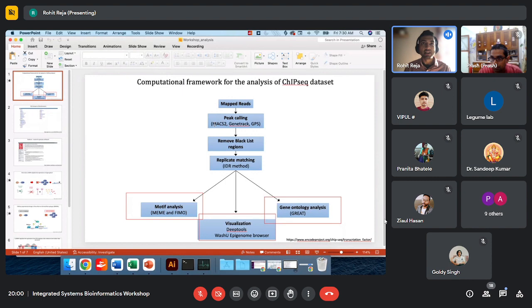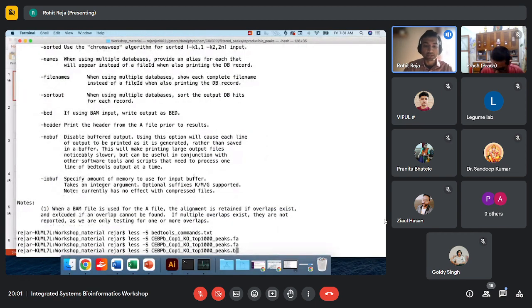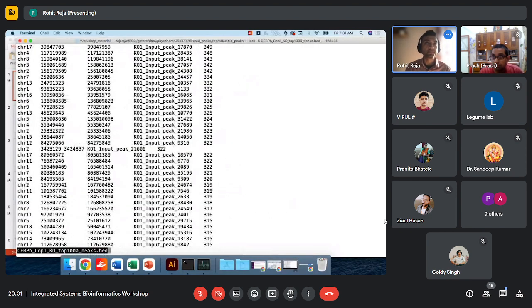And then you can run MACS2, which can also be done in Galaxy, or you can do it on your server. You download this tool, you run it on the BAM files, and that's how you get the MACS2 output, which is these peaks that I've been showing you, which basically looks like an enrichment across your genome.